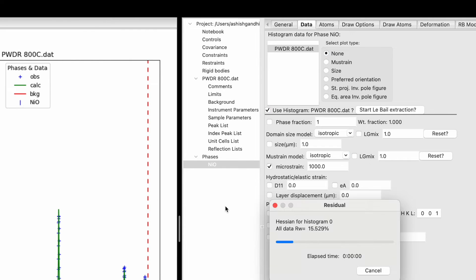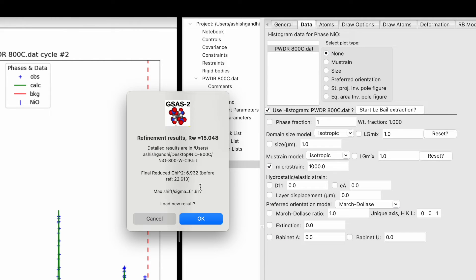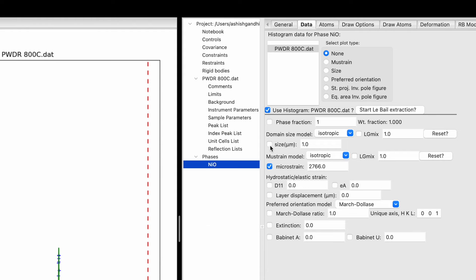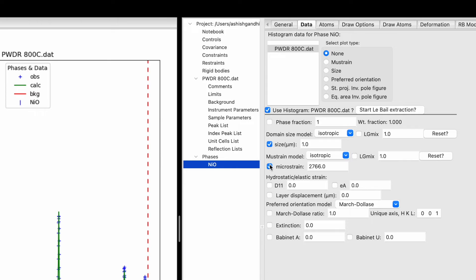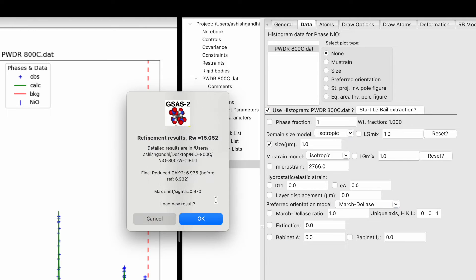Select microstrain and hit Command+R — it shows 6193.2. If we try to refine both size and microstrain together, it shows 'highly correlated parameters', which means this is not allowed. So click cancel, remove microstrain, and click on size only. Now we don't see that message, and our chi-square is 6193. Not much change.